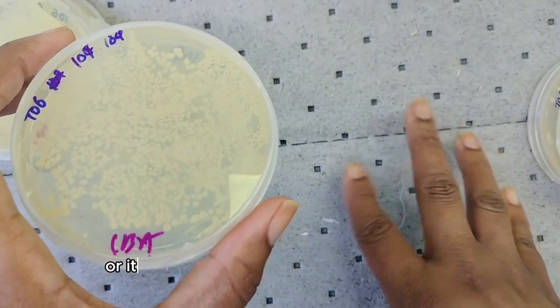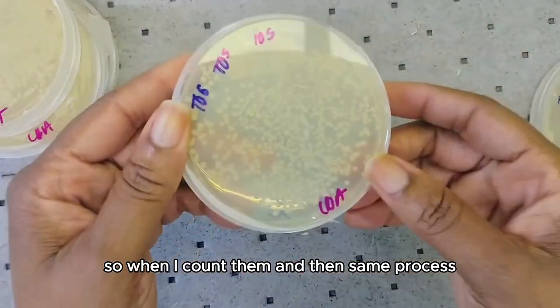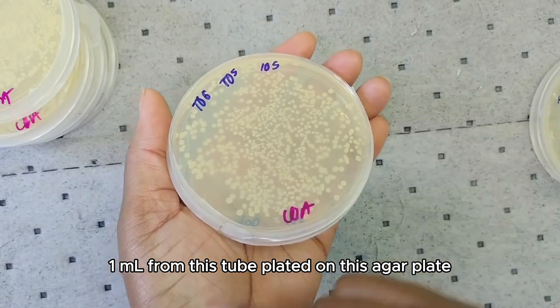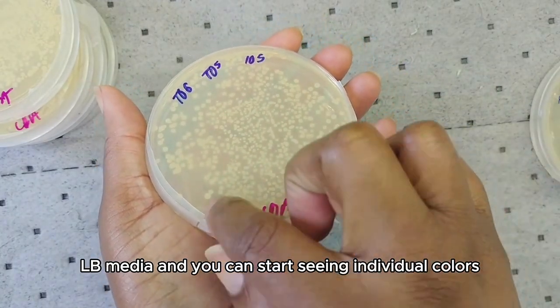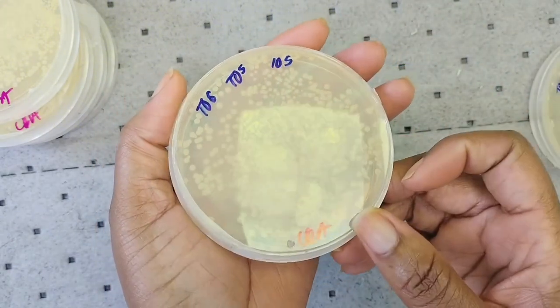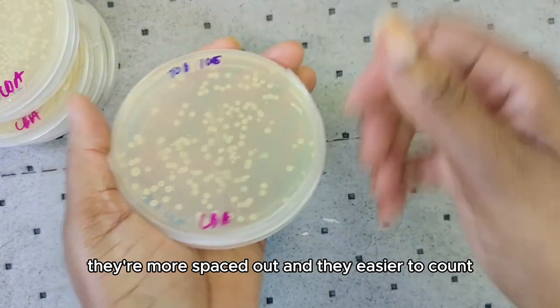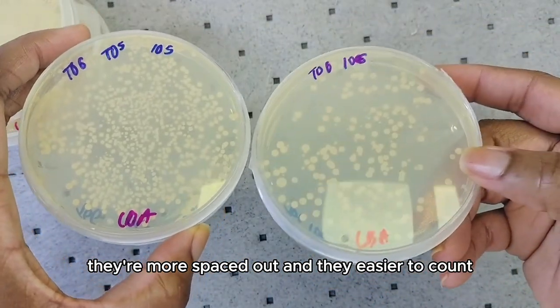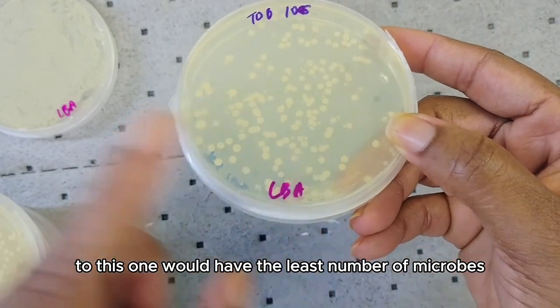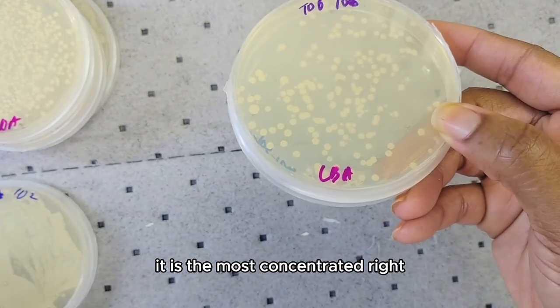What I want is individual colonies that fall between 30 to 300, or it could be 20 to 200 colony forming units. The same process — 1 mL from this tube plated on this agar plate; they're all LB media. You can start seeing individual colonies. I still think this is a bit much, so I'm going to use my final tube. As you can see the colonies are more spaced out and easier to count, so this one has the least number of microbes.